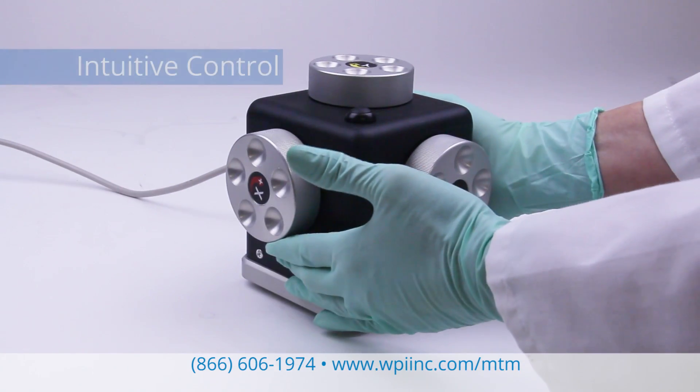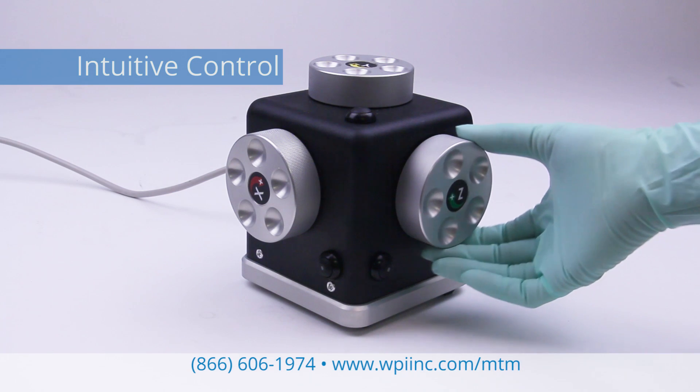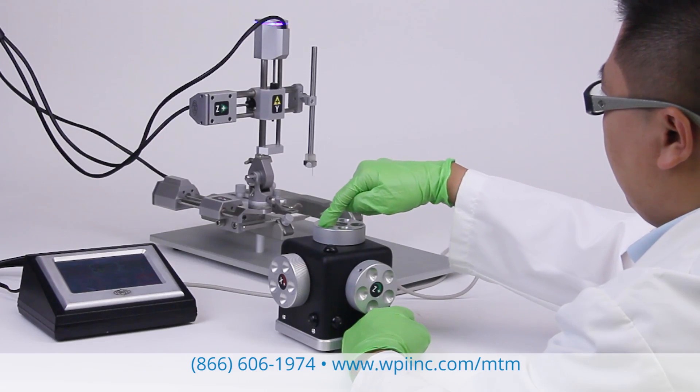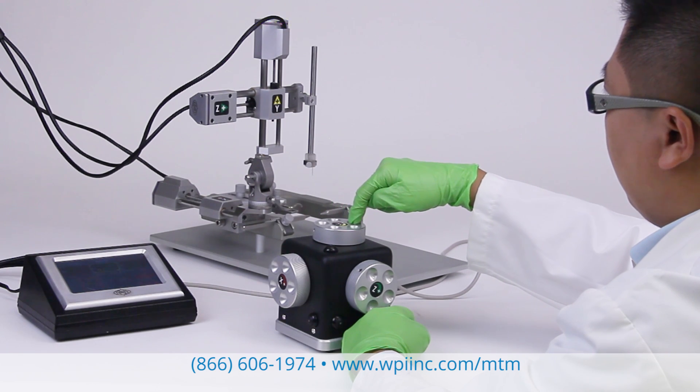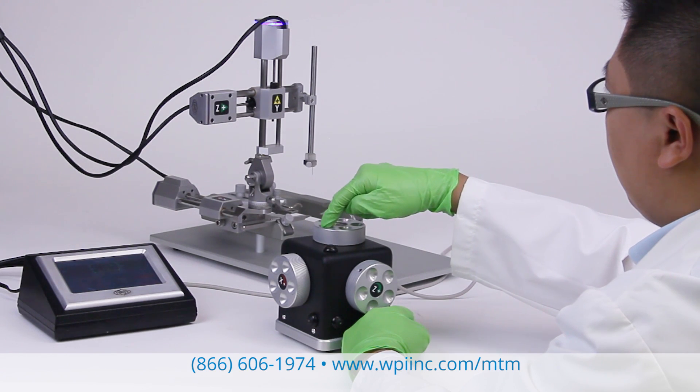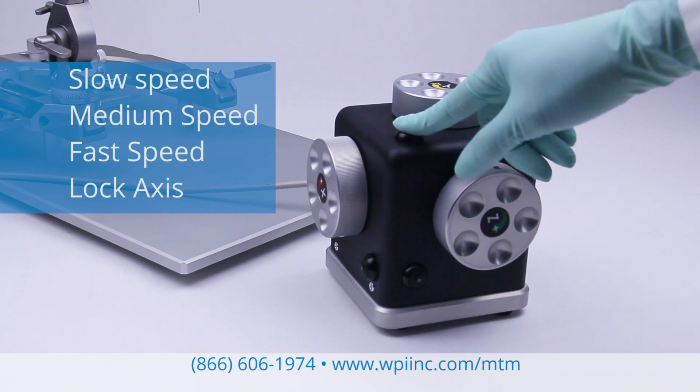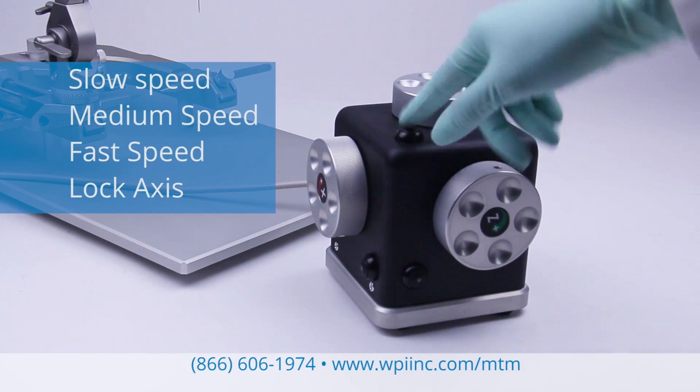The hand controller gives you intuitive and tactile control of the manipulators. It is especially helpful when you're using a microscope for precise placement of probes. The hand controller has a dial and a button for each axis. The buttons allow you to quickly toggle through speed controls and lock the axis.